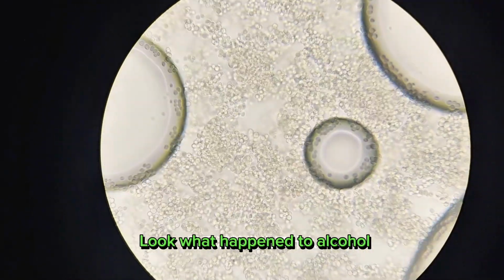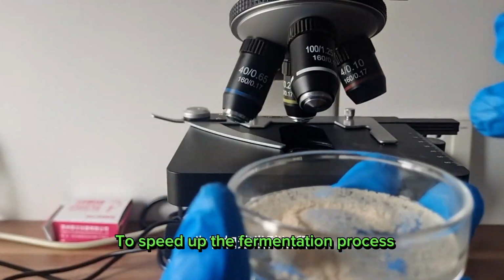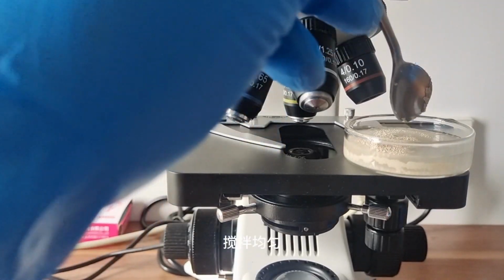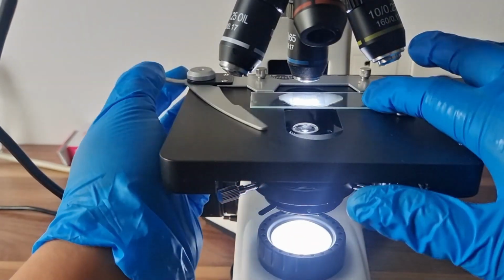Look what happened to alcohol. Pour a small amount of dry yeast first. Add a small amount of warm water. To speed up the fermentation process, add some white sugar that yeast loves most. Mix well. Leave for 20 minutes. It's growing like crazy. Take a drop and put it on the slide and start observing.